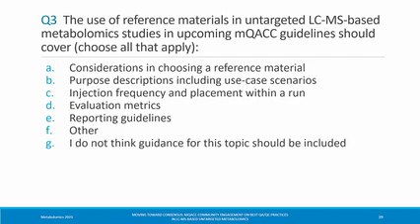But again, it's limited in scope in terms of what metabolites are measured by validated methods by NIST. In the lipids case, we have the harmonization study that we can rely on as well, but that's also limited in scope. I think cost is one issue, and in that case, it's primarily an American population, so it might not be appropriate for other population groups, perhaps. Yeah. Okay. In response to that, we have under a minute.